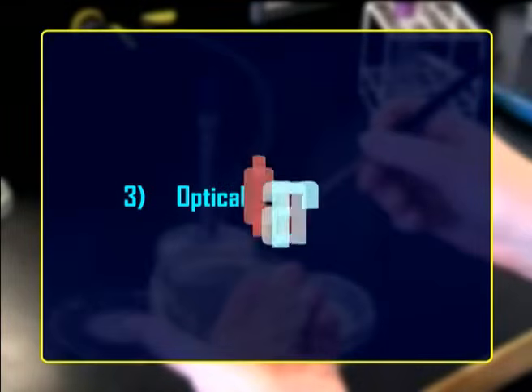Soluble pigments may be blue, green, yellow, brown, or other colors. Pigmentation occurs within the organism itself, or as a water-soluble pigment that diffuses into the surrounding medium. Optical characteristic, evaluated on the basis of the amount of light transmitted through the growth, is described as opaque, translucent, or transparent.